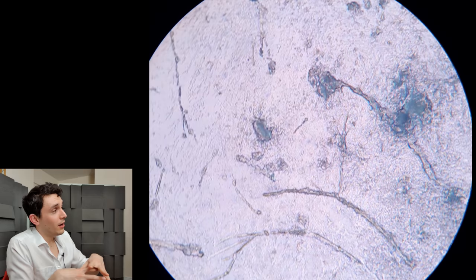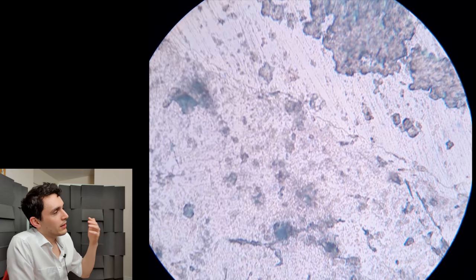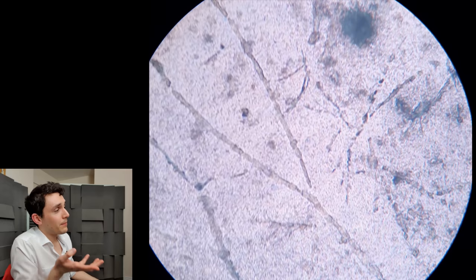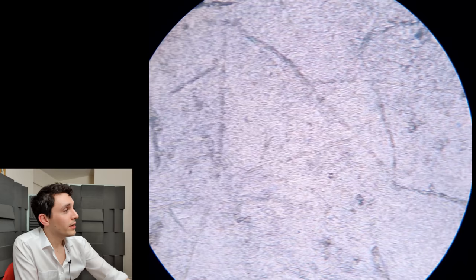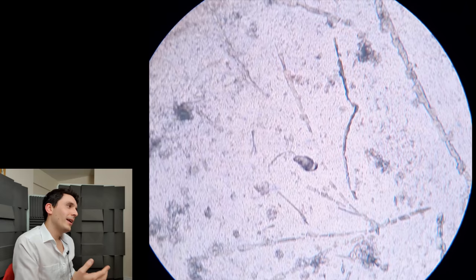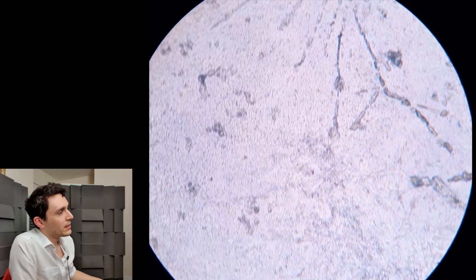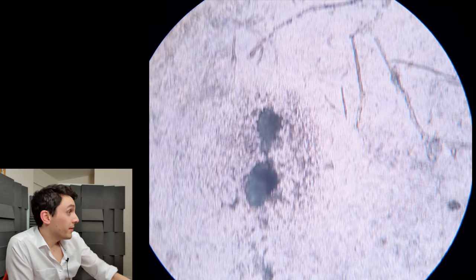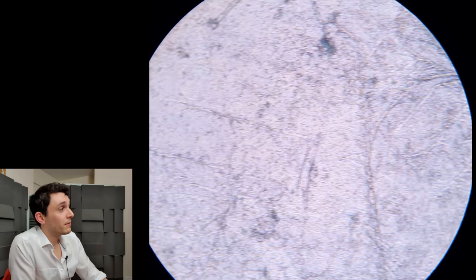I have to mention that having fungus on your body is totally normal. There's fungus on me, there's probably fungus on you. Here again, you can see hyphae hiding within the debris — it's quite normal. But what makes me suspicious in this case is just the amount of hyphae that's showing up on the slide — it's quite a lot. I rather suspect that this is a fungal infection and that's what's causing the rapid desquamation.